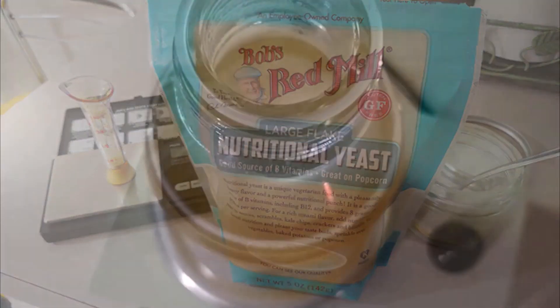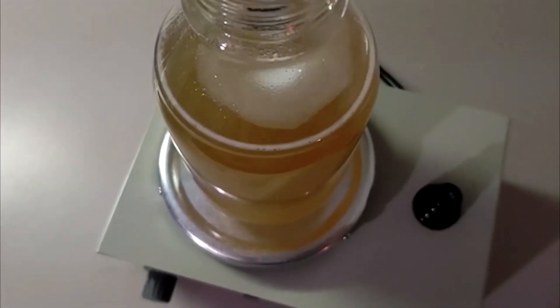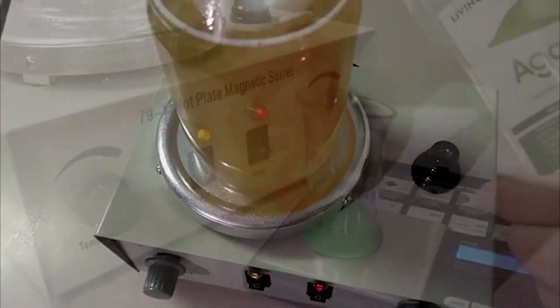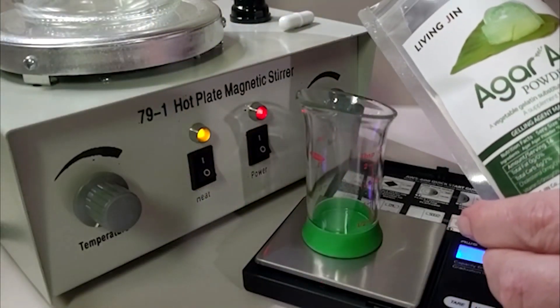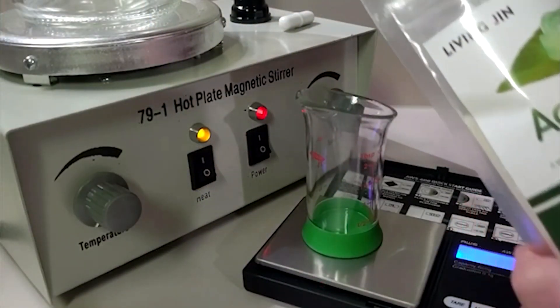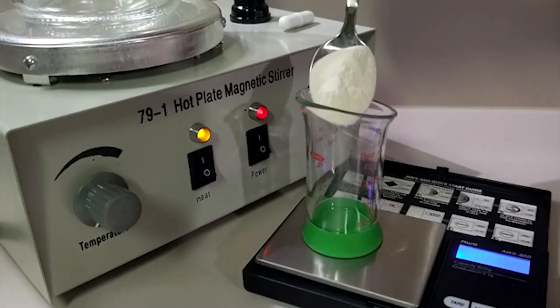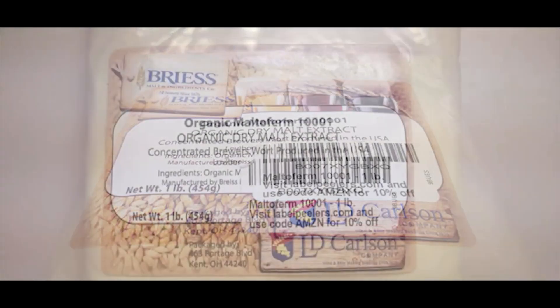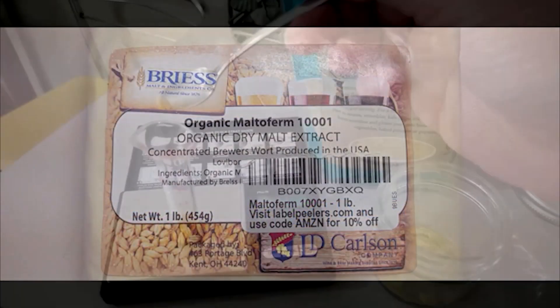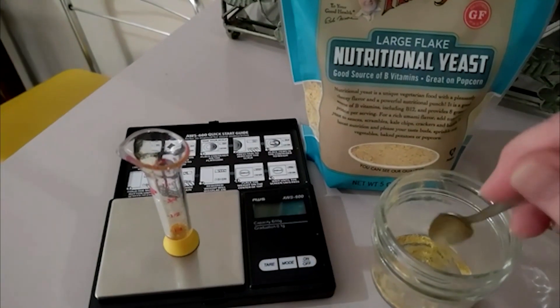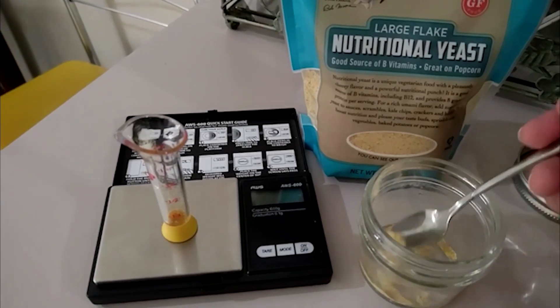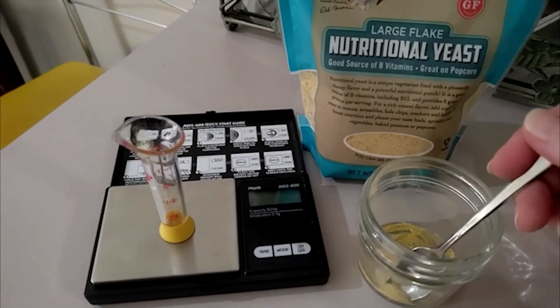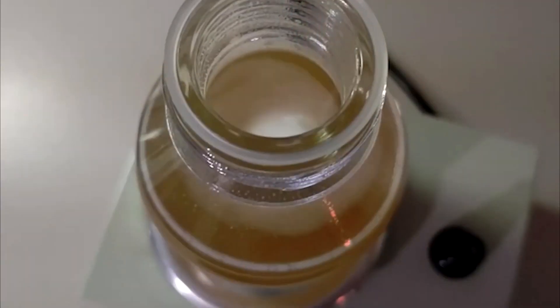We experimented with many different recipes and really feel we've perfected this one. When creating 500 milliliters of agar, you want to use 10 grams of agar, 7.5 grams of malt extract, and 0.25 grams of nutritional yeast—yes, 0.25 grams of nutritional yeast to create 500 milliliters.